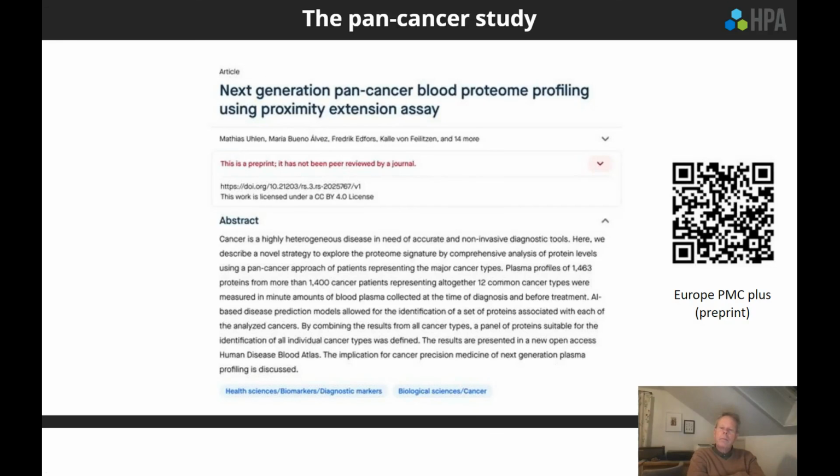I think what you point out is the real-time nature of proteomic or protein testing in blood, right? That it's an accurate real-time indicator of general health. And if you had a baseline for individuals, and like you say, when things start going awry, when signals start to change, how powerful that can be. But exactly. Just like you mentioned, there is so much individual variation, right? That's driving protein determination. How does that all start? But we start somewhere.